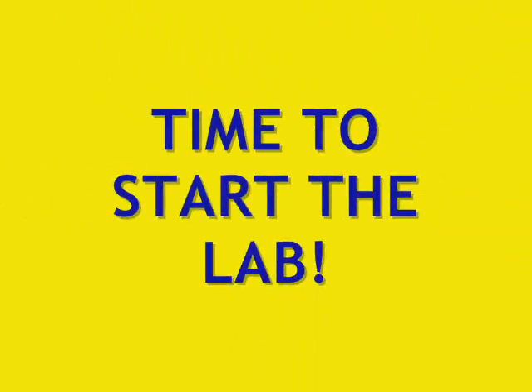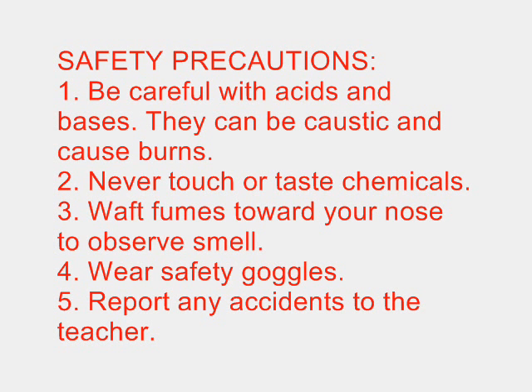You are now ready to begin Chemistry Lab 2.5, Acids and Bases. Don't forget the safety guidelines for this lab. Be careful with acids and bases. Don't touch or taste the chemicals. Waft the fumes to smell them. Wear safety goggles and report any accidents to your teacher.